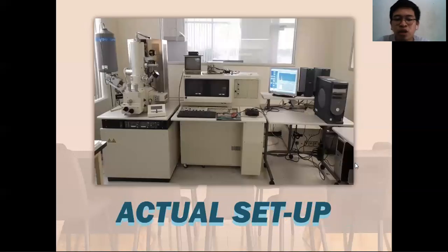Now here is an actual setup of an SEM-EDX machine inside the laboratory. As you can see, this is the SEM-EDX machine connected to the computer or the software which will analyze the process that is involved in this machine.